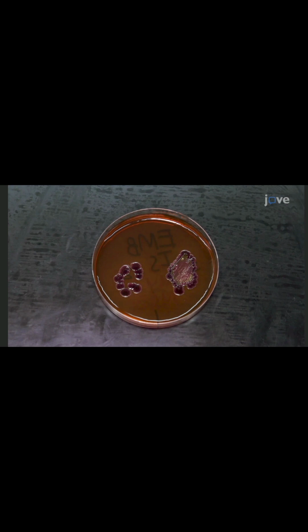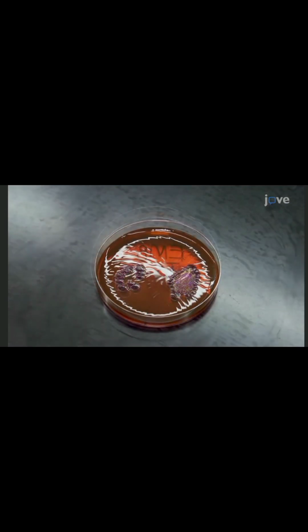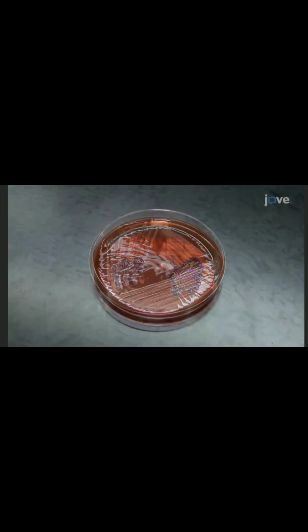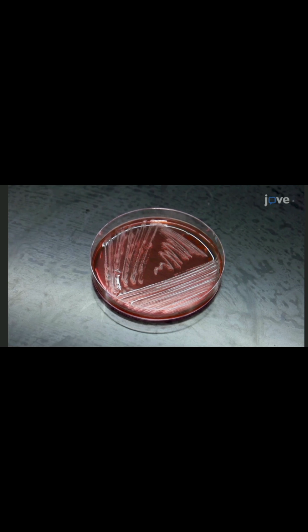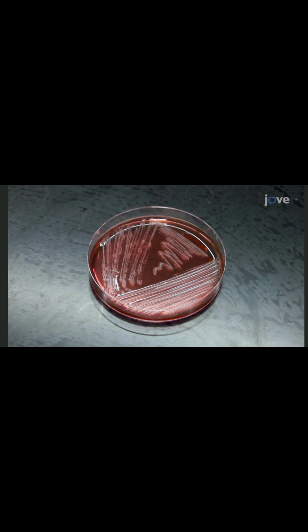Moreover, this medium indicates whether the bacterial species present is able to ferment lactose. Here, E. coli colonies turn a dark purple color, sometimes with a green metallic sheen, indicating fermentation. P. vulgaris grows on this medium but does not ferment lactose, and so appears a light pinkish to purple from being in the presence of the dye.